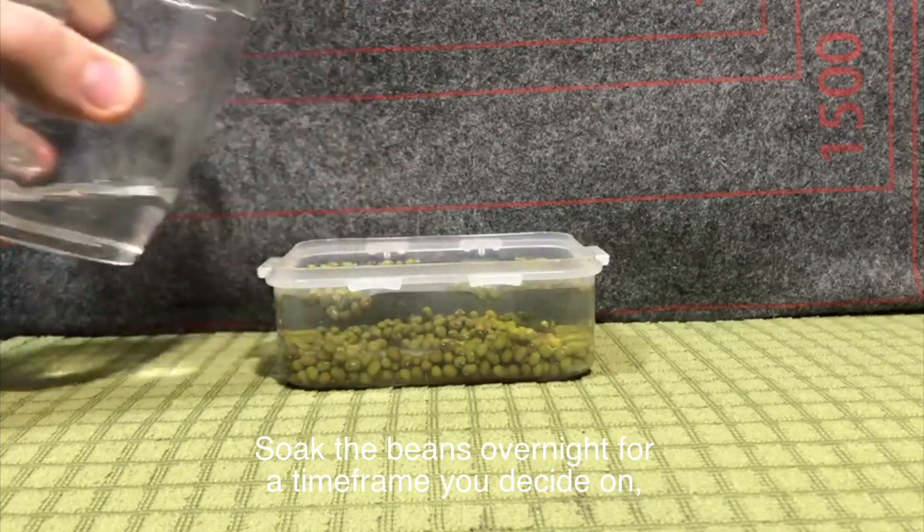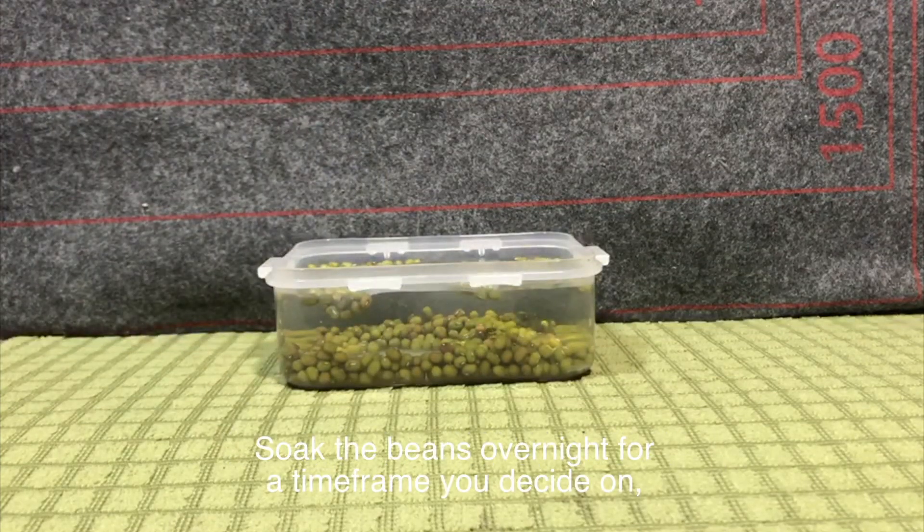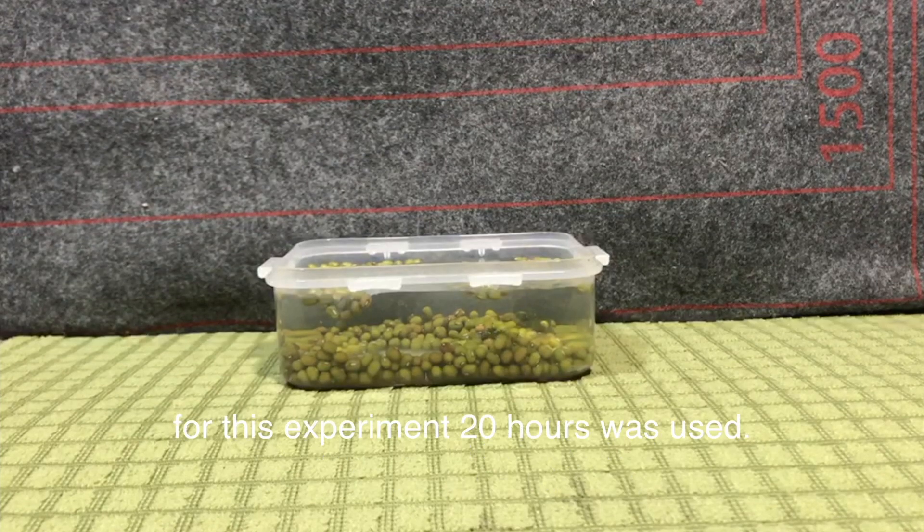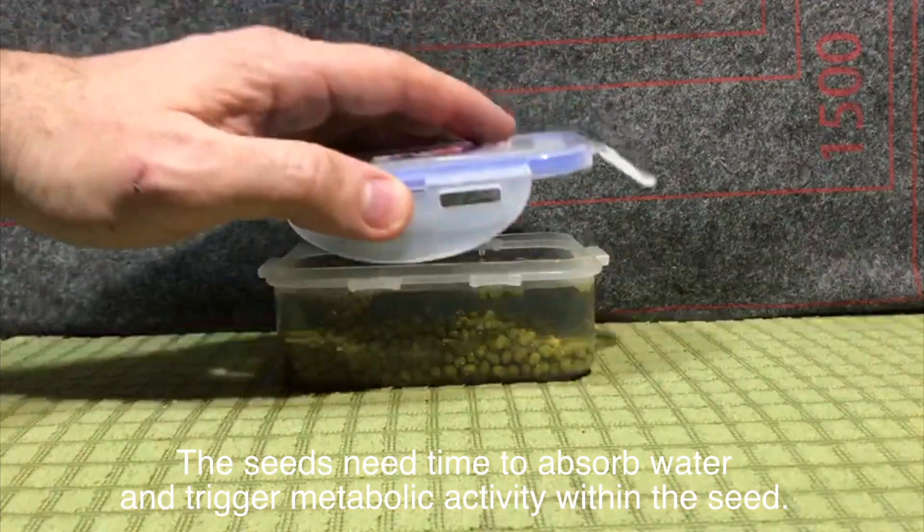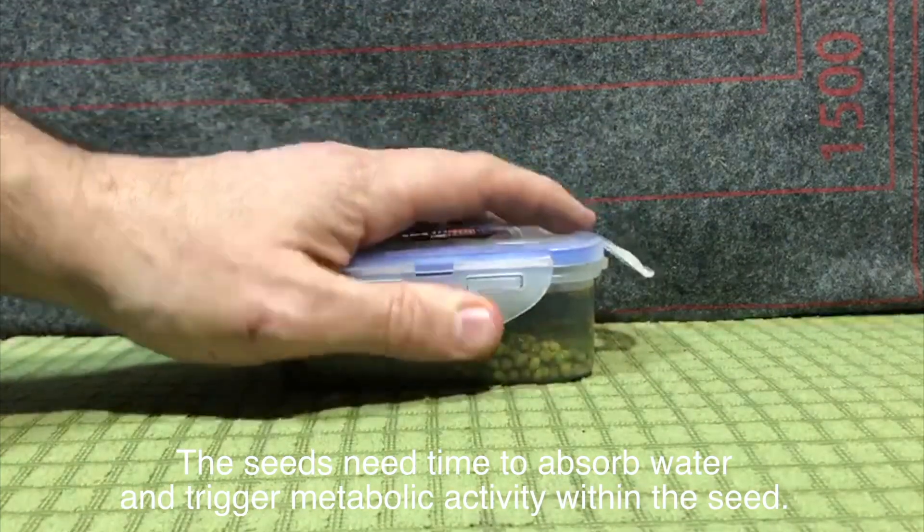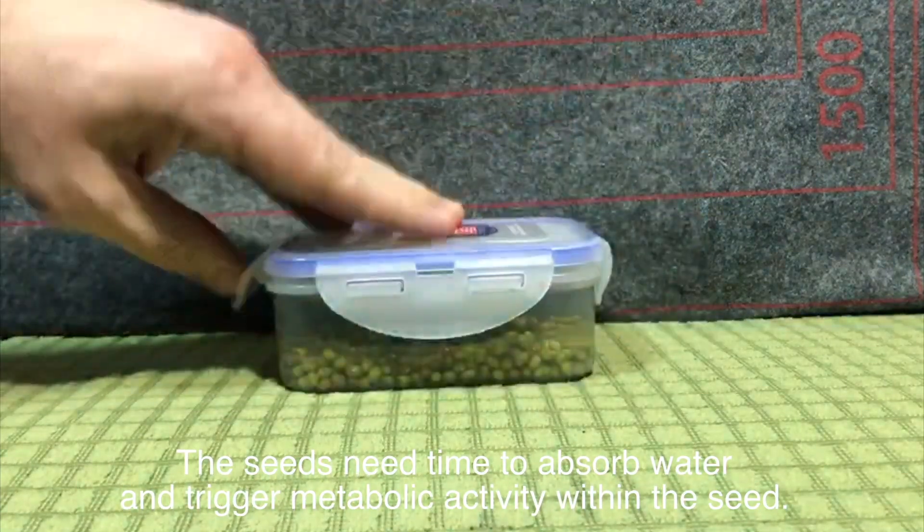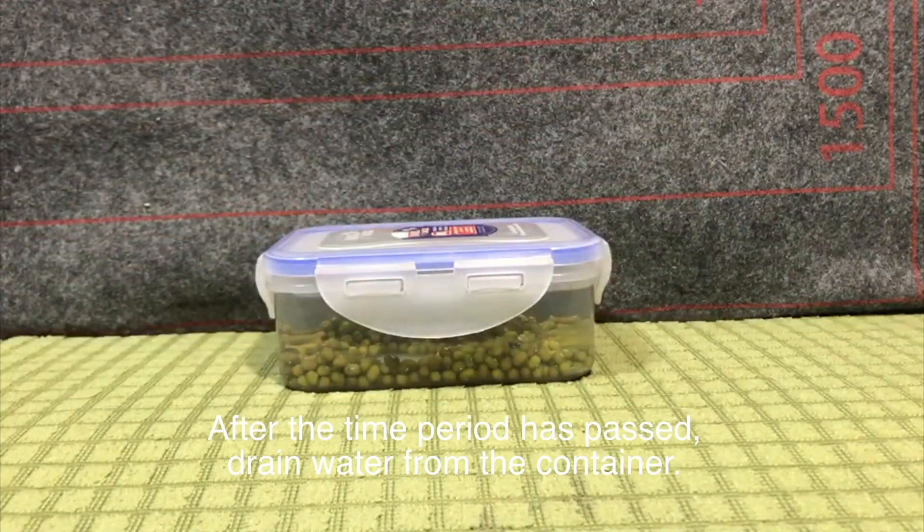Soak the beans overnight for a time frame you decide on. For this experiment, 20 hours was used. The seeds need time to absorb water and trigger metabolic activity within the seed. After the time period is passed, drain all the water from the container.